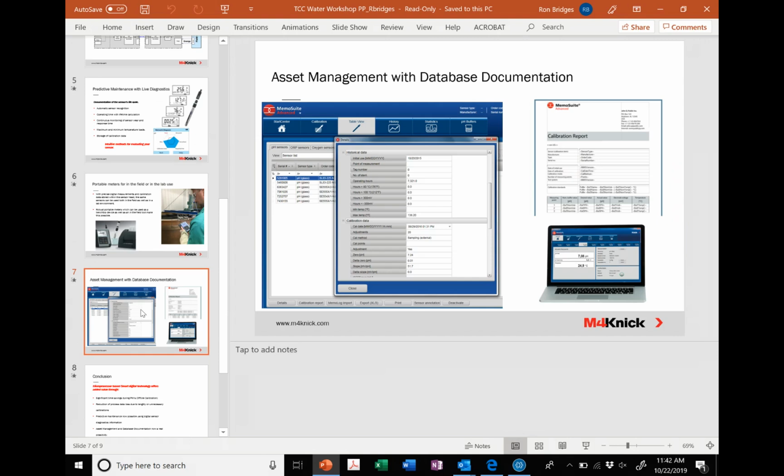And one final piece of information to share, because we do have the ability to collect data, now there's the ability, especially if you're in situations where you have to record calibrations and document that the preventative maintenance is being done, because it's a Title V water permit where you have to show someone in the future that you are maintaining the measurements and doing the calibrations, there are software database packages that we can bring to bear that store that information.